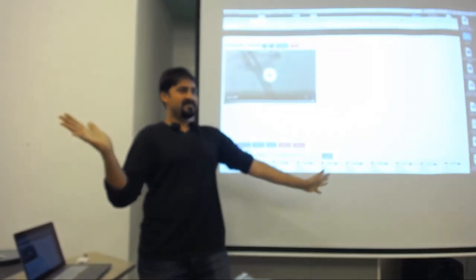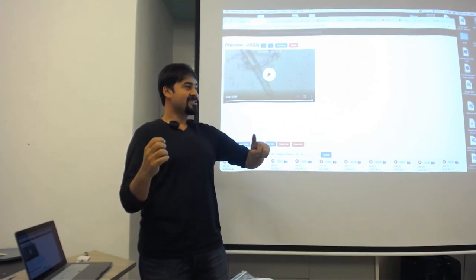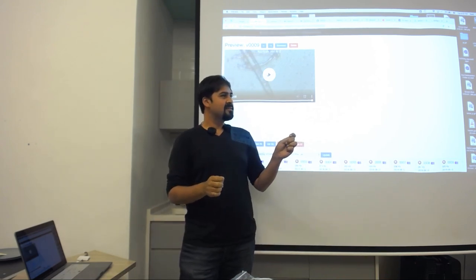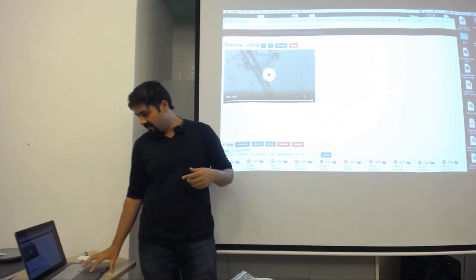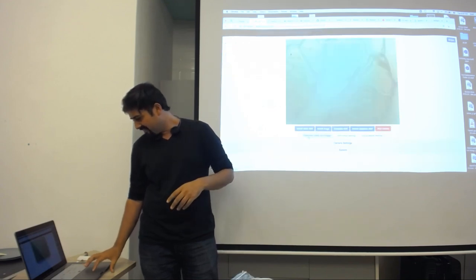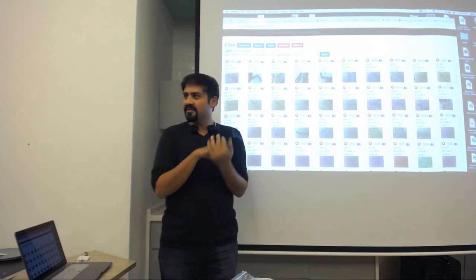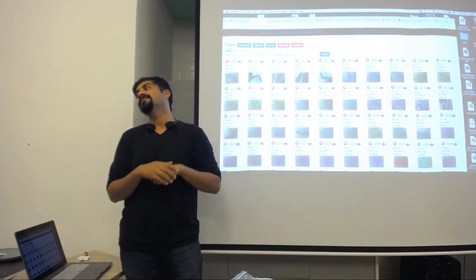Anything else? Darren, you want to add anything? Show them the feathers. The feathers? Oh, I don't have that sample, unfortunately, but we discovered pictures. You saved the pictures, right? On this one? No, it's on the other one. It was on the 3B Plus, unfortunately. I've got 2 microscopes. This one creates its own hotspot. The other one connects to my own Wi-Fi, so I didn't want to share my own Wi-Fi password with you. Sorry.